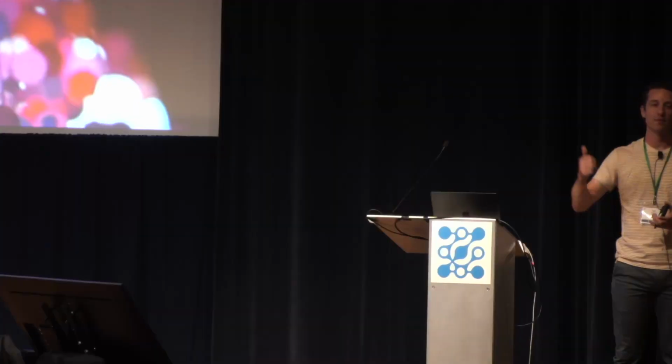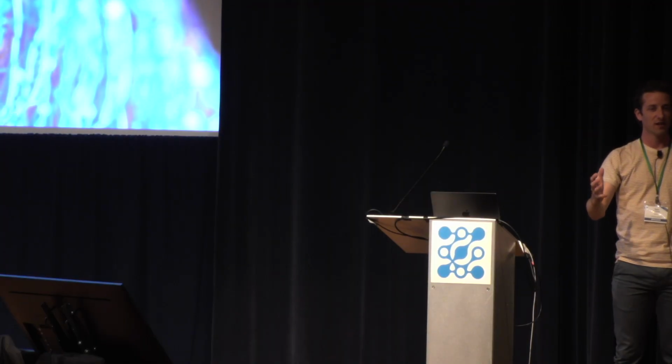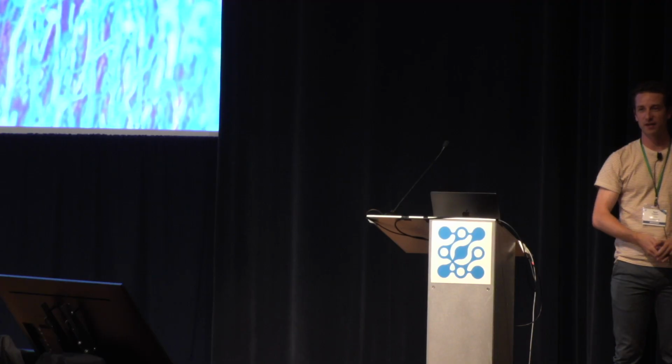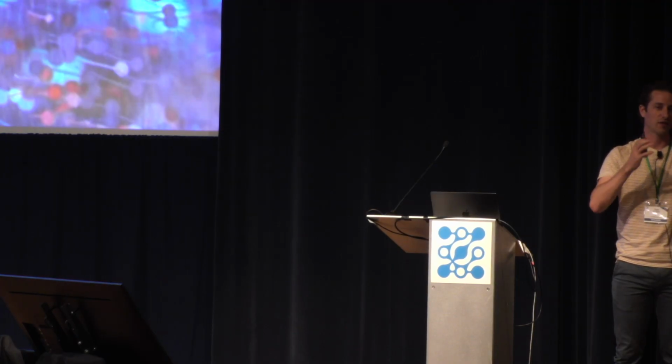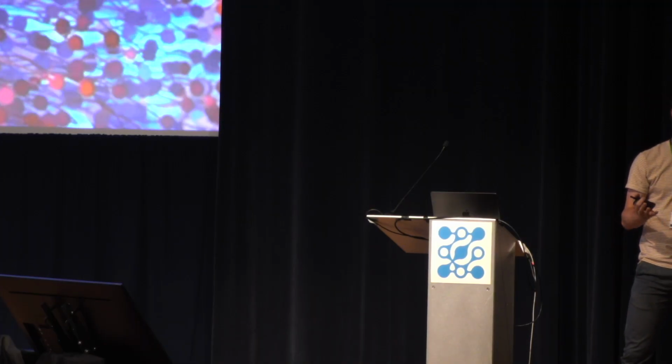So the one I'm showing many times, the zebrafish, is a 24-hour imaging session. The data set is around 10 terabytes, I think 1,000 time frames. When you have a nice GPU cluster or CPU cluster, this case took about 5 hours.